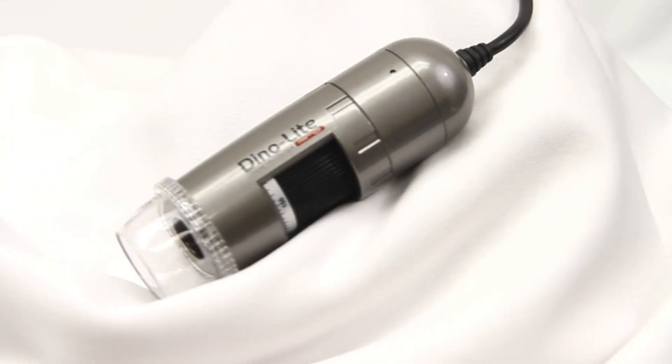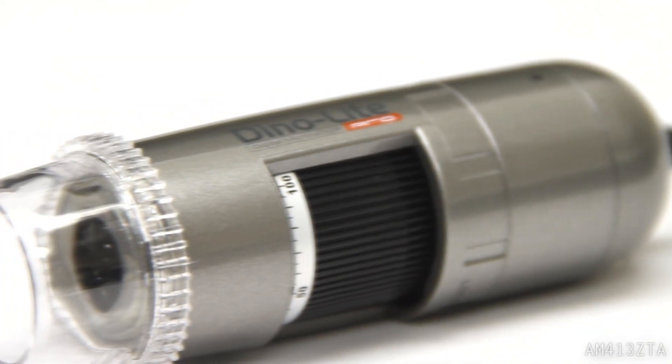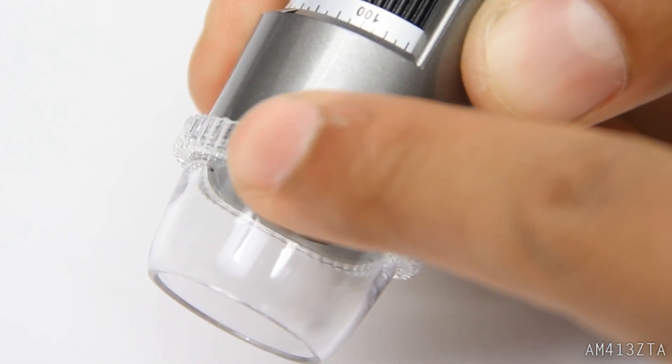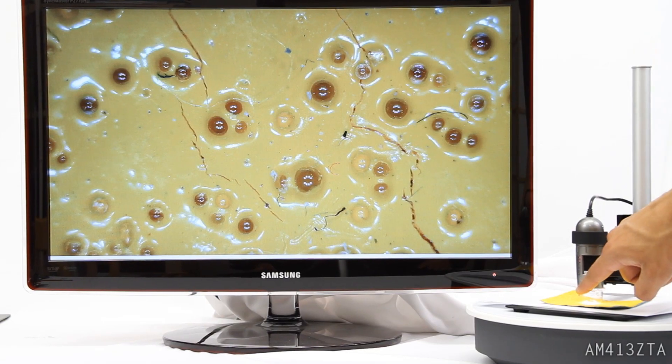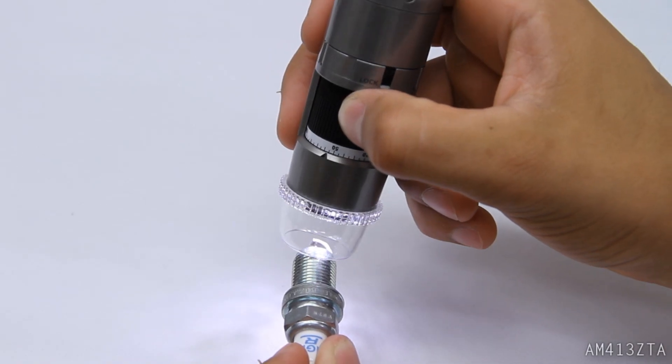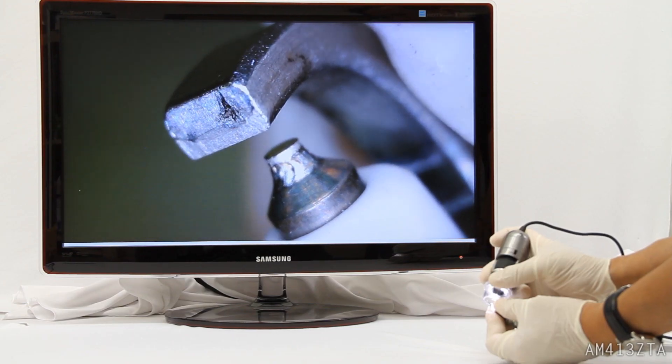Introducing the Dino-Lite AM413ZTA handheld digital microscope camera with built-on polarizer. Simply rotate the polarizer filter to easily remove glare from reflective surfaces, offering a much clearer and higher quality view.